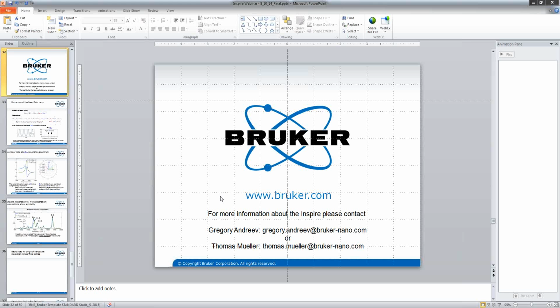Okay, thanks. So that's good. I guess the good thing is that one doesn't need contact mode and it's lateral forces.